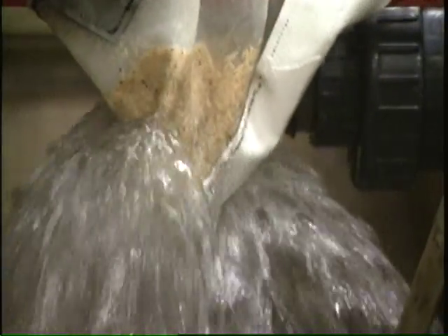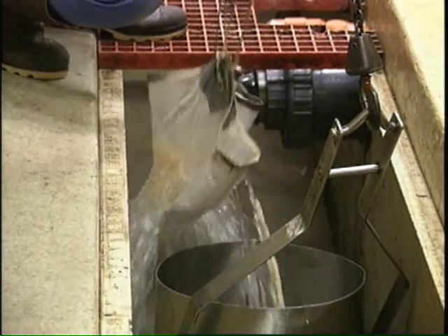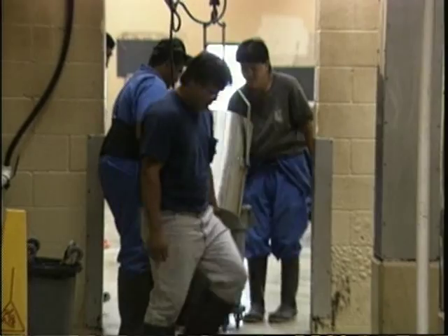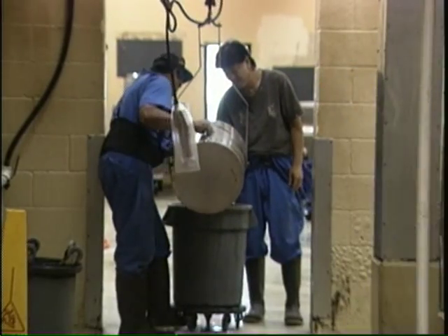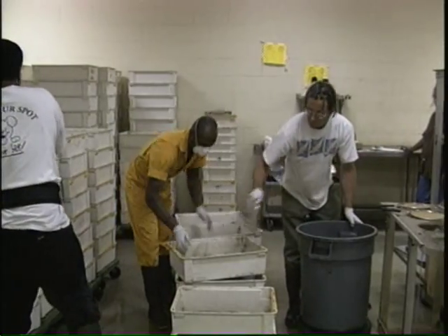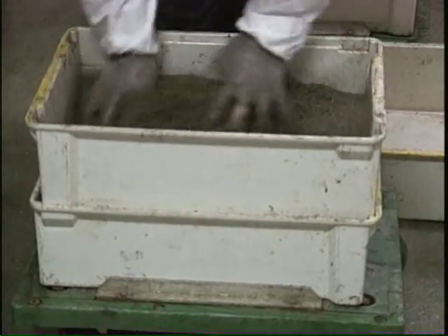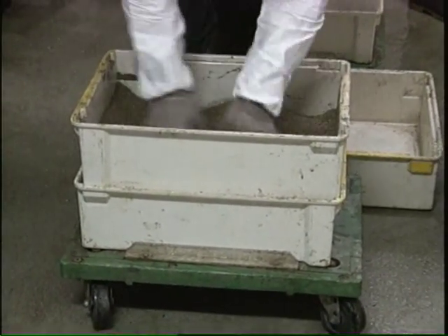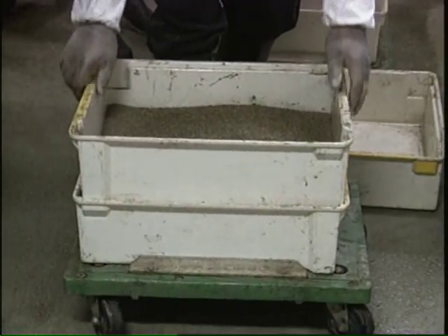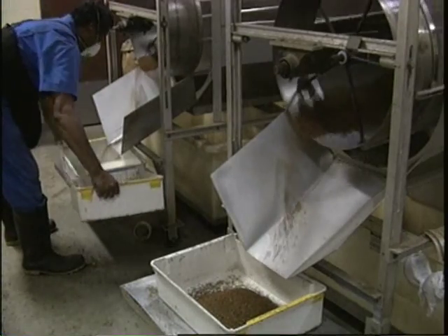After concentrating the larvae, the collector pours the larvae into a collection bucket. This collection bucket is lifted and rolled along a hoist trolley to the end of the so-called pop room. There, the collected larvae are transferred into plastic containers and taken to the next room. The collected larvae are mixed with vermiculite and placed into pupation boxes. The boxes are placed in the pupation dark room for two days. At the end of two days, the pupae are sifted out of the vermiculite.